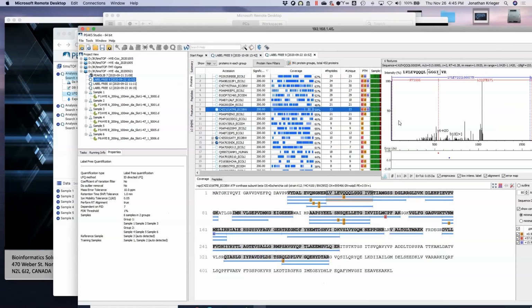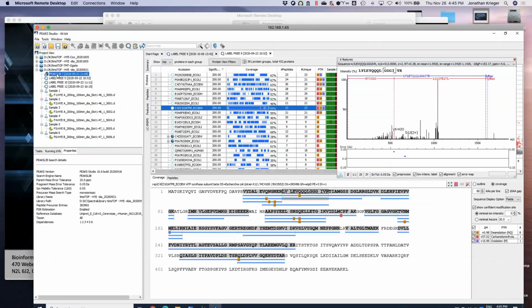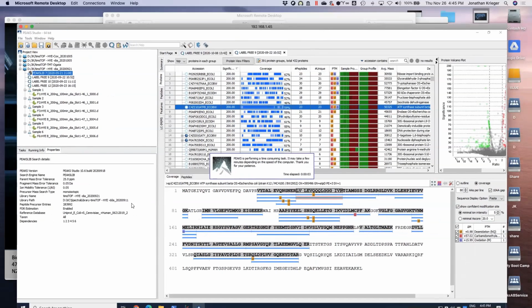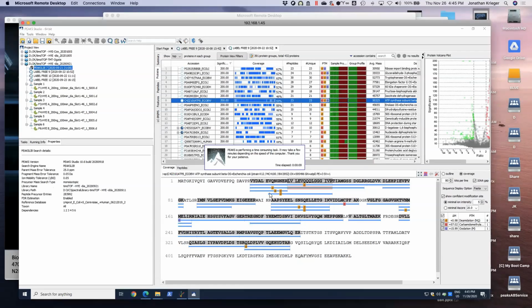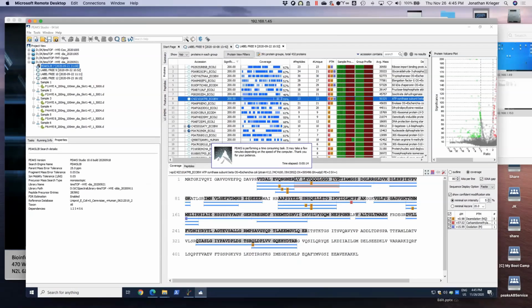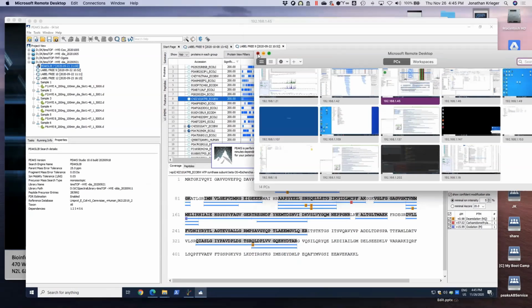Yeah, I still don't have this library here. Okay, well, I apologize for that. What you should see is what I showed you in online, where the matches actually look quite nice, as we would expect. I must have removed the library unintentionally. I actually switched computers right before this. So again, I apologize for that.